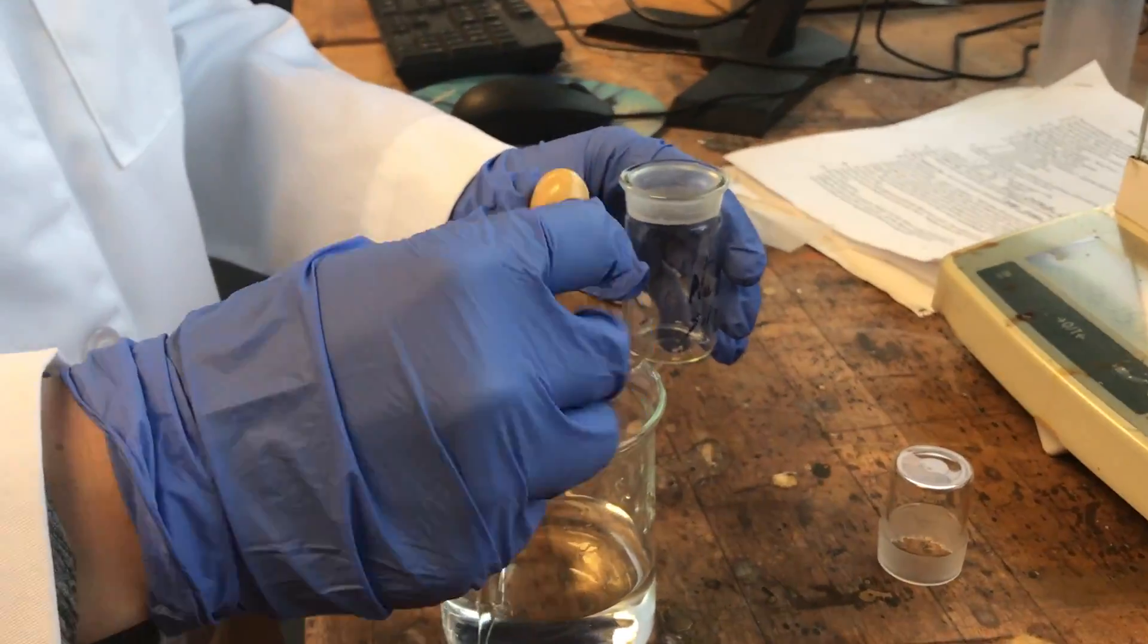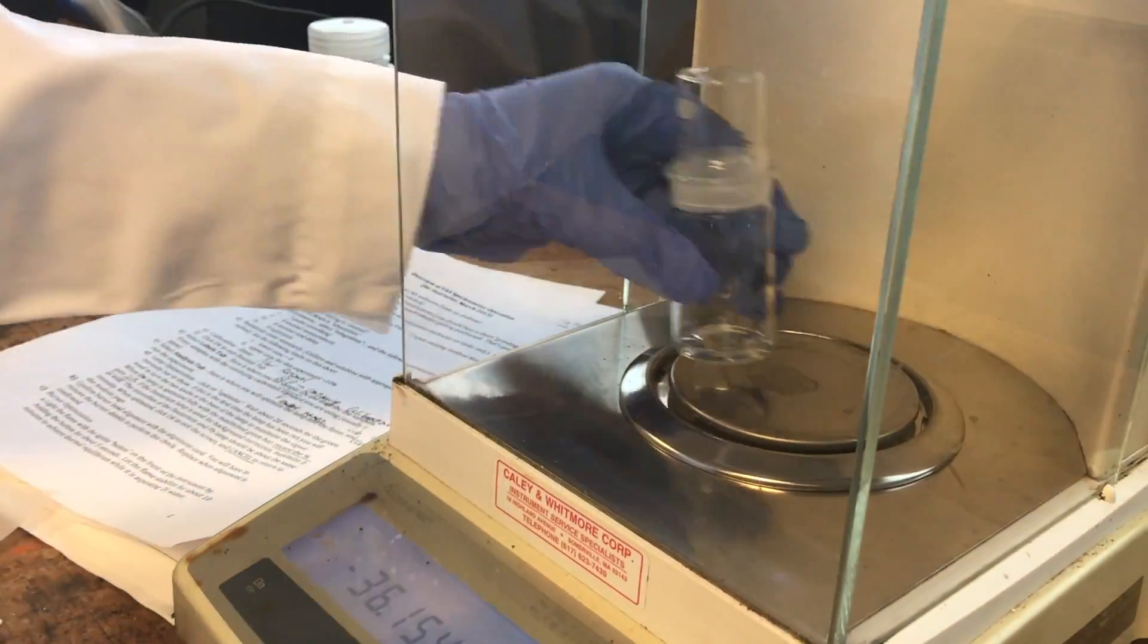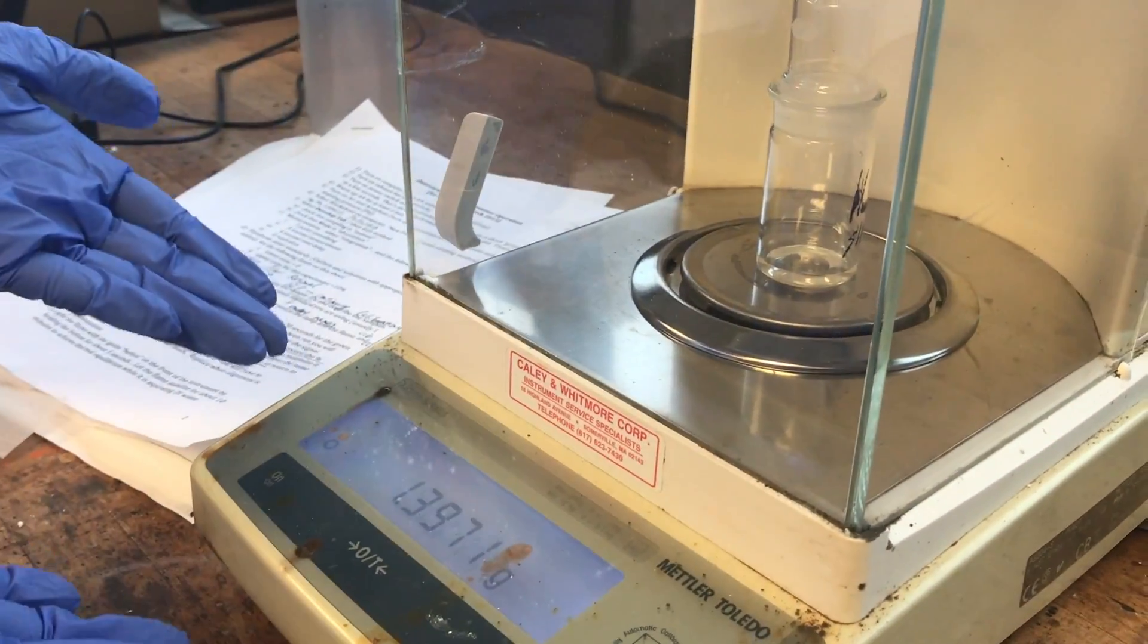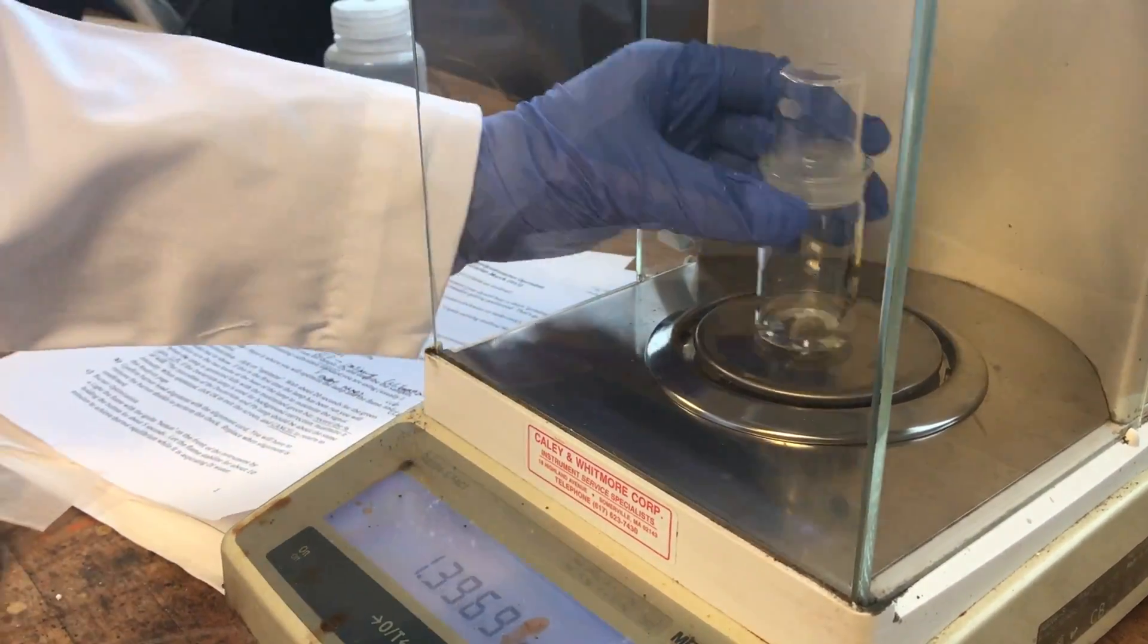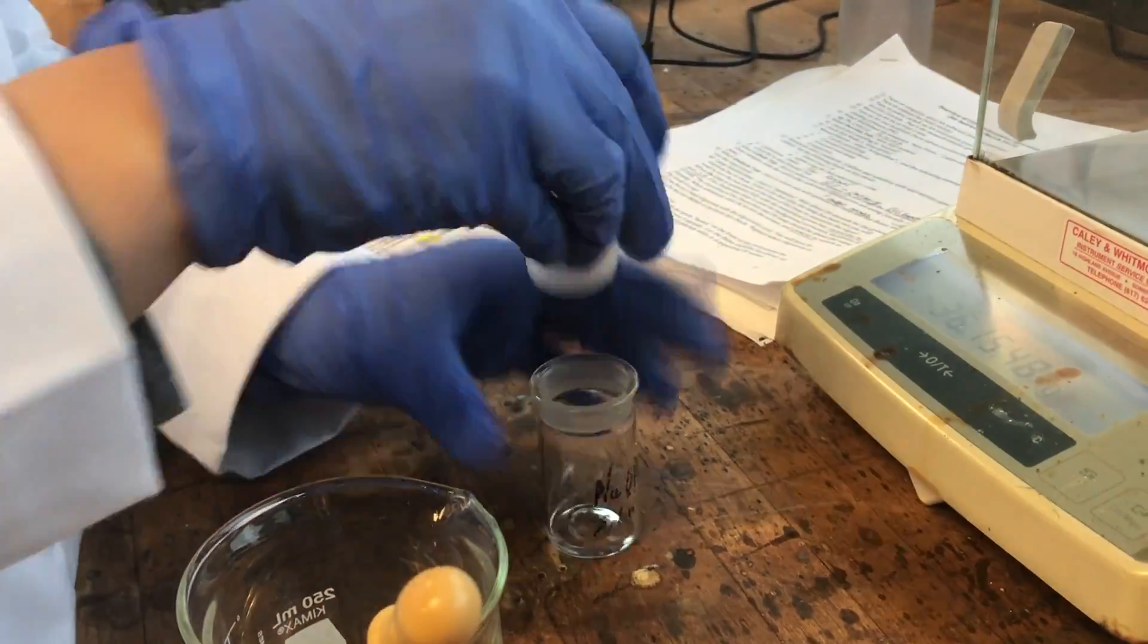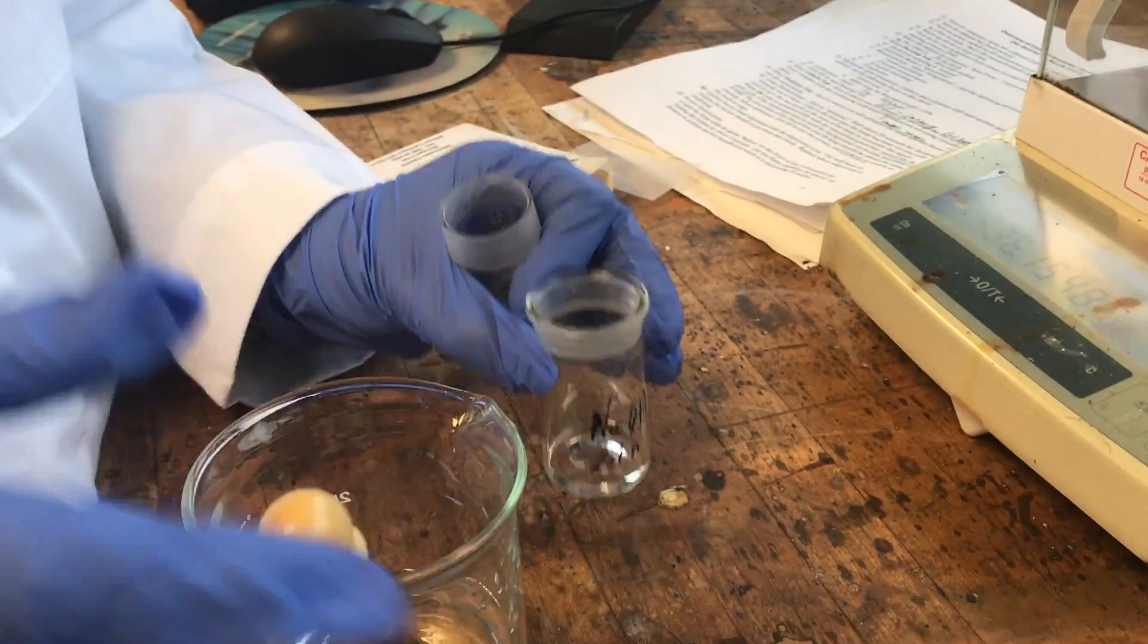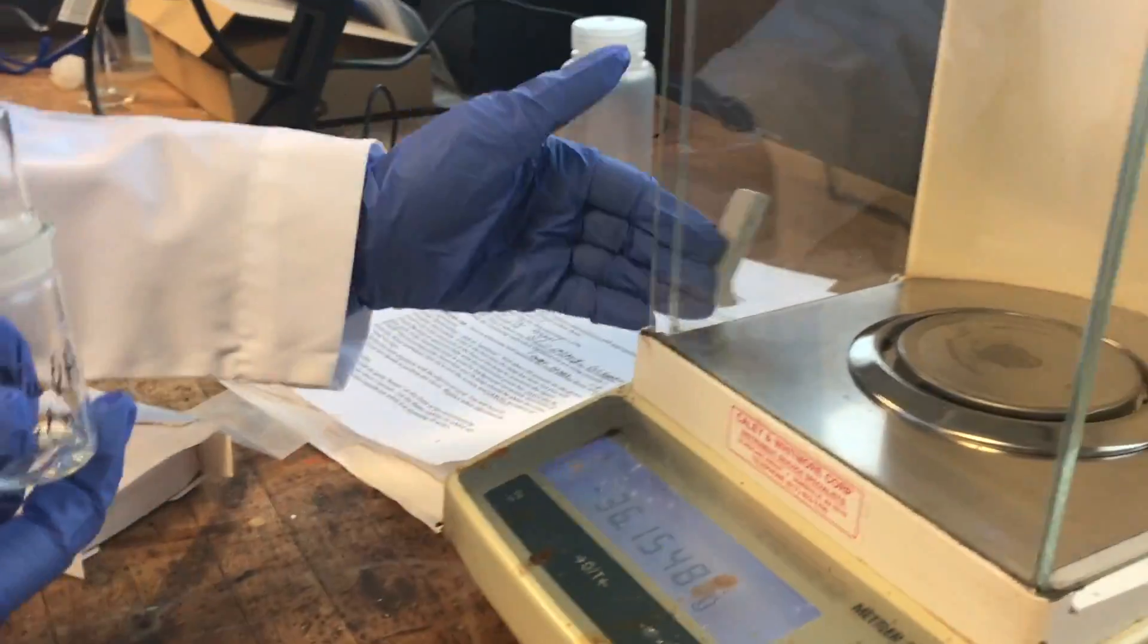Next, add the liquid to the weigh bottle. And then put the weigh bottle back on the scale. If you need to add more, make sure to remove the weigh bottle from the scale. Never measure directly on the scale.